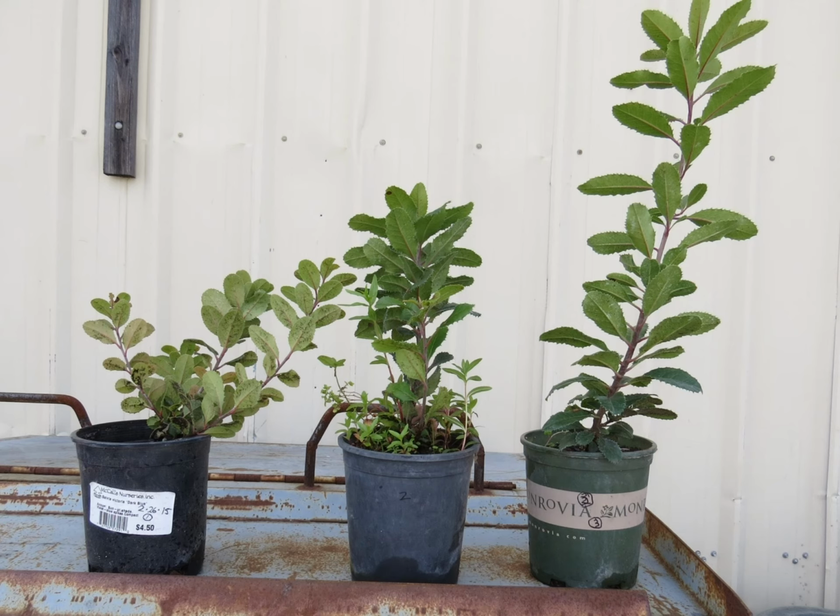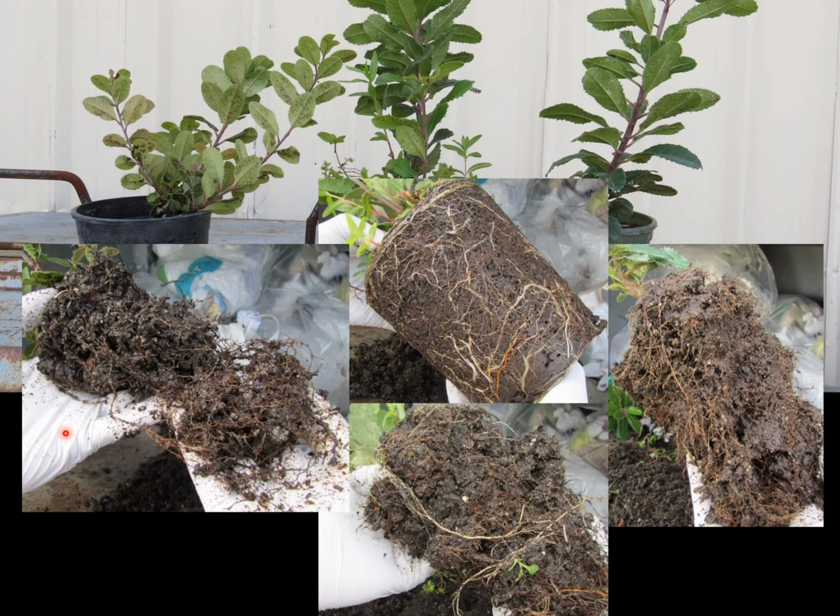So here we have 3 toyons growing in 1-gallon containers. We can see that they're all potentially passed as healthy. The one on the left here is perhaps the least healthy of the bunch. But to cut to the chase, the root systems of all 3 of these plants are heavily decayed. Only the center one has some live roots in any kind of quantity, whereas the other 2 have almost no live roots at all.